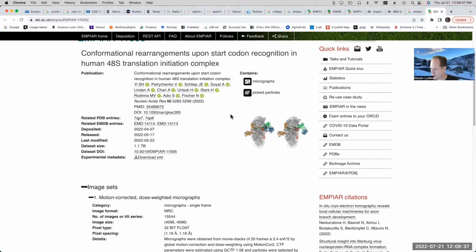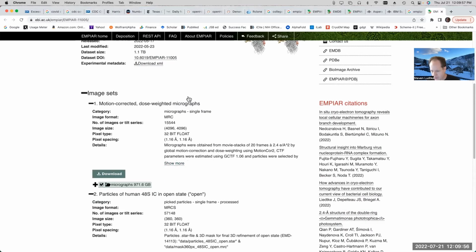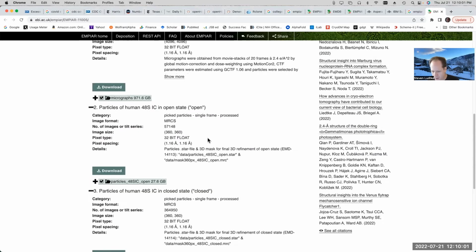There's only some groups that will really try and upload not only the raw data, but also the boxed out particles in the star file that they got from their Relion or their CryoSPARC refinements and whatever. So this was an example of the data set where they provided both the raw micrographs as well as two subsets of the particle data, which had been classified into an open state and a closed state.